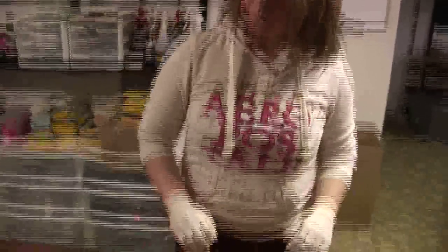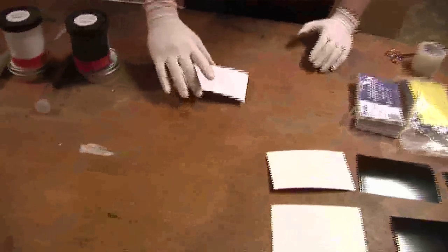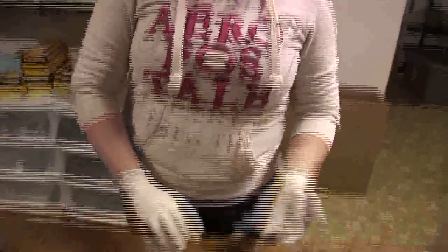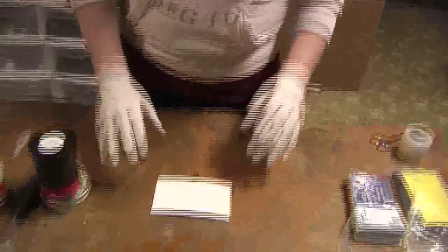We'll start off with black powder. What you want to remember when you're dusting for fingerprints is contrast. Whatever your background is, you want to make sure that you pick a powder that is going to give good contrast against your background. Here we have a white background, so I'm going to start with black dust.